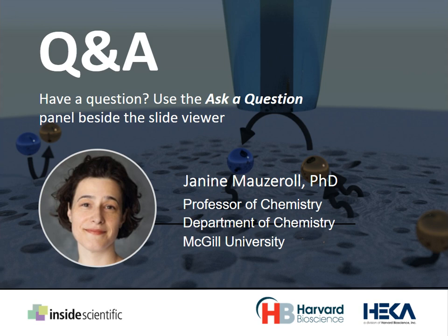In our group, we've developed some magnesium ion selective electrodes. When people want to detect a particular ion like magnesium or aluminum 3+, they'll make an ion selective electrode, and that electrode is sensitive to the activity of the ion in solution. And so there are reports on this.